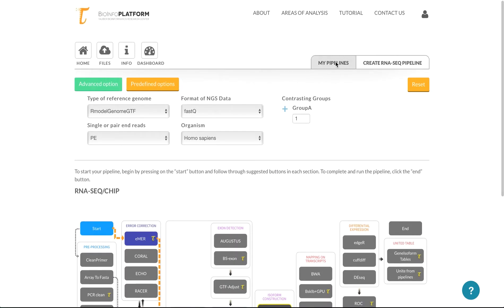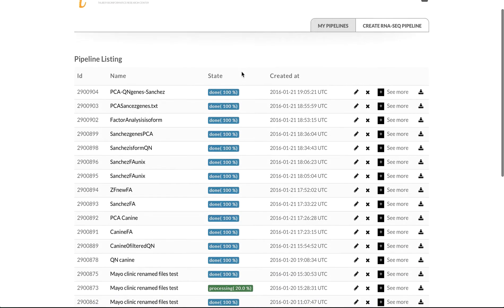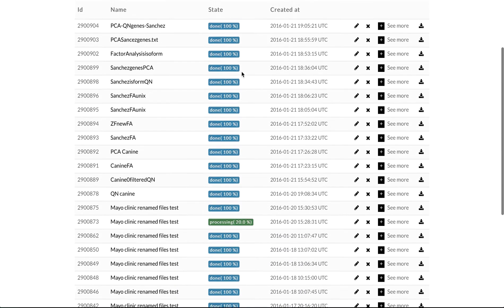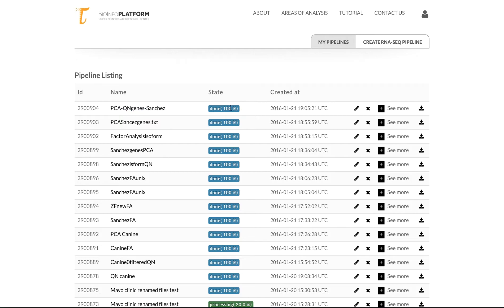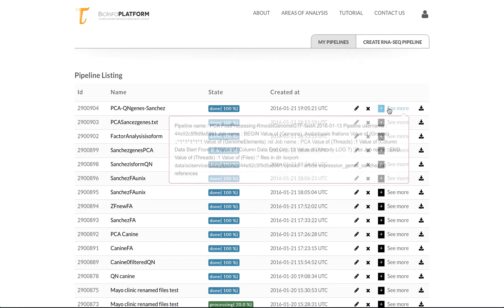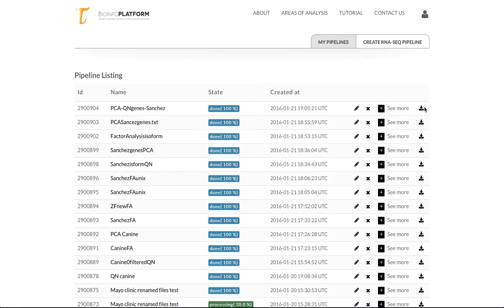You can also see all of the different pipelines that are being run by this user. So you can see the ID of the pipeline, the name of the pipeline, the status, when it was created, you can edit the name, you can delete it, you can also see more information that gives you some technical information, and also download the report. That will be a PDF report of this pipeline.